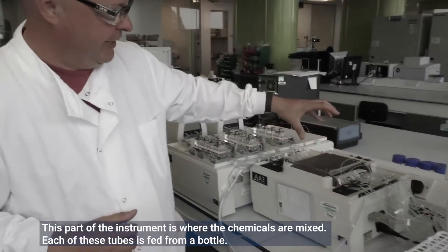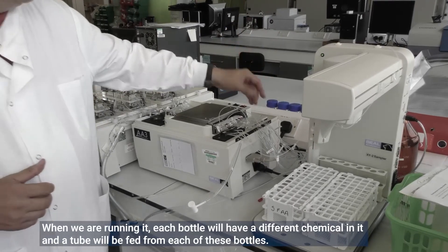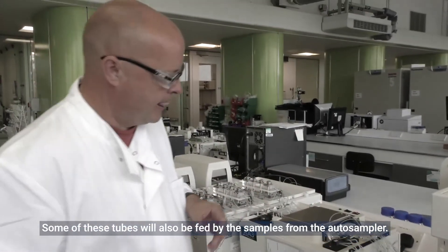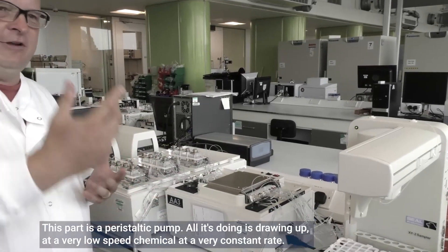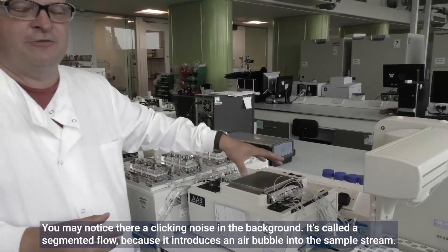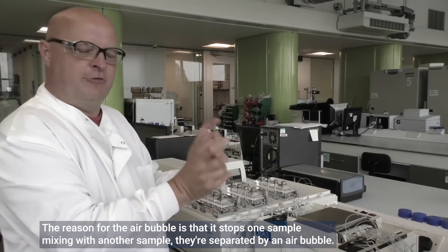This part of the instrument is where the chemicals are mixed. Each of these tubes is fed from a bottle, so when running, each bottle will have a different chemical in it with a tube fed from it. Some tubes will also be fed by samples from the autosampler. This is a peristaltic pump — all it's doing is drawing up chemicals at a very low, constant rate. It's called a segmented flow because it introduces an air bubble into the sample stream.